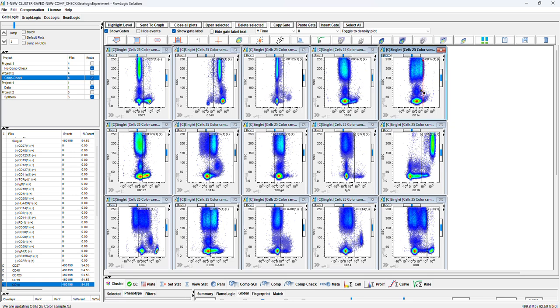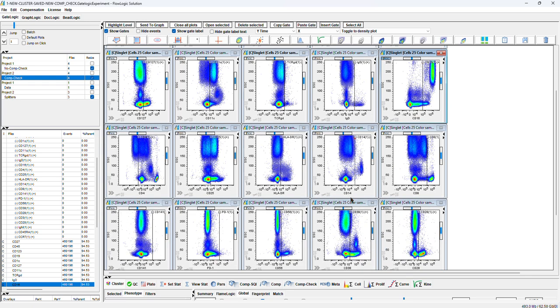This is not okay. And we do an adjustment, and the adjustment will update the settings in the table. So we adjust.